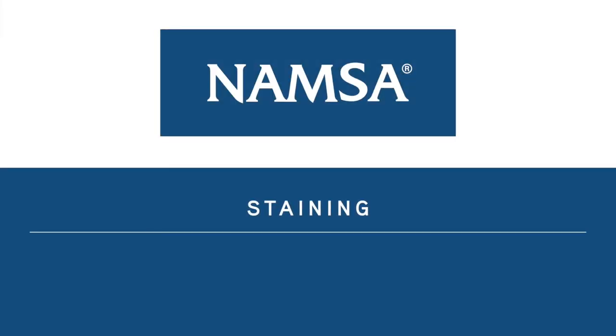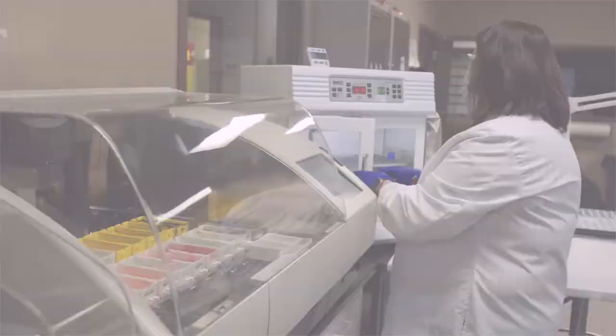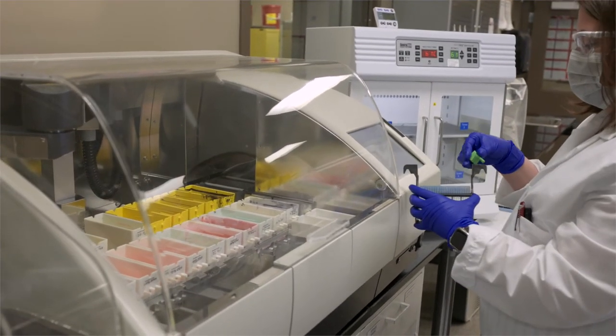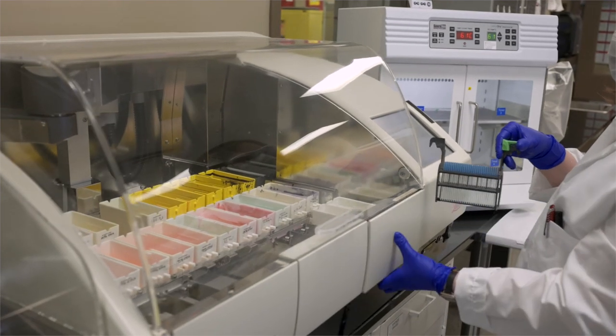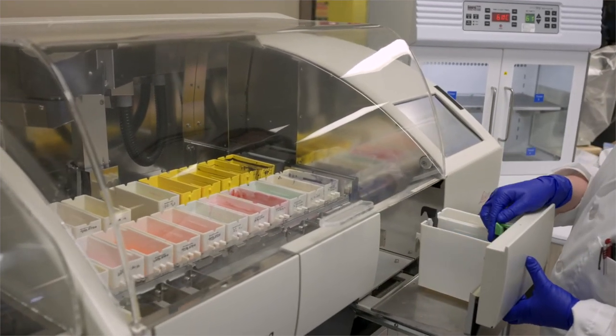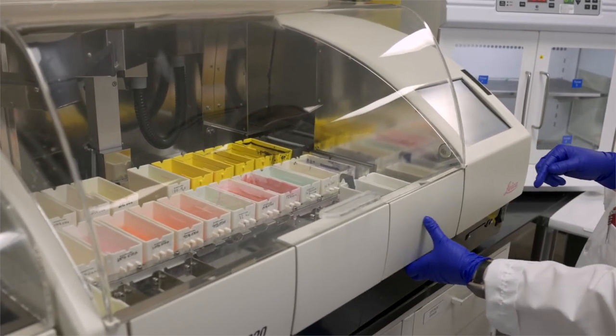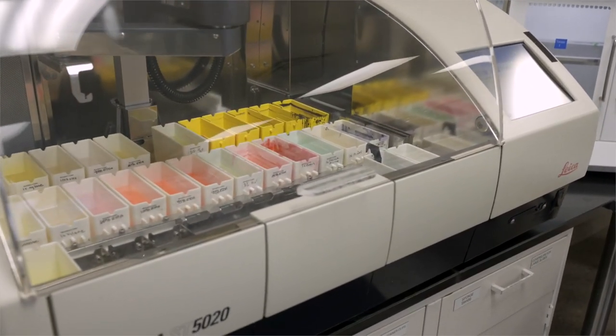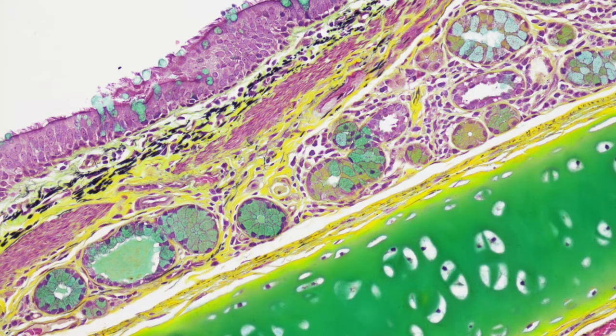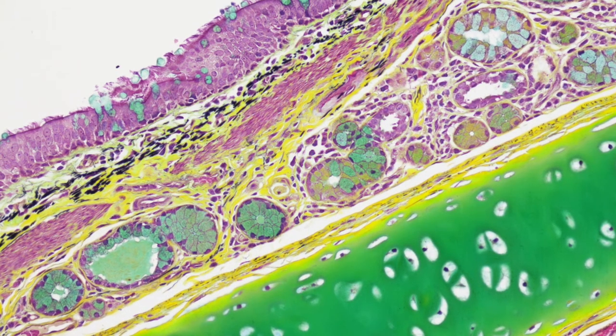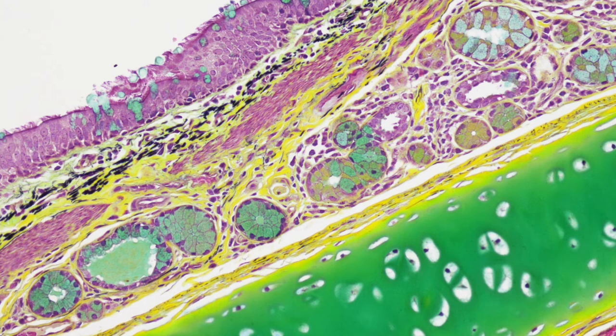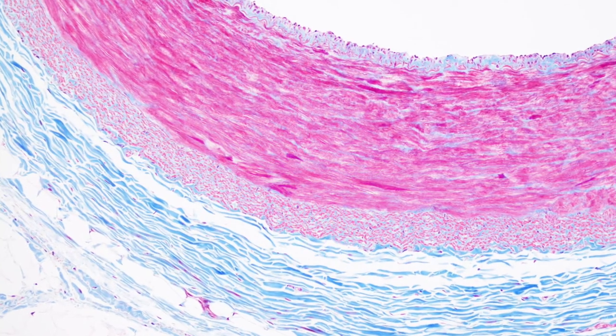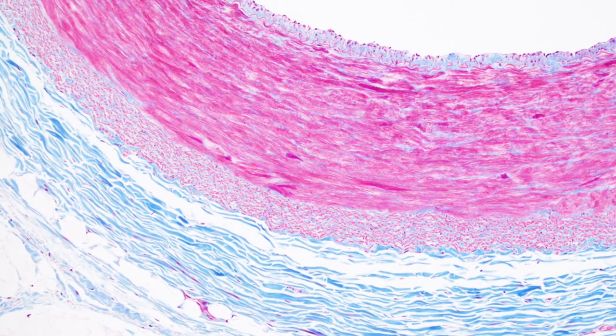Staining. An automated hematoxylin and eosin, H&E stain, is performed on both paraffin and plastic slides on the majority of study samples. We offer 22 different chemical stains for paraffin and thin section plastic. Most commonly used are pentachrome to demonstrate mucin, fibrin, elastic fibers, muscle, and collagen. Masson's trichrome to differentiate between collagen and smooth muscle.